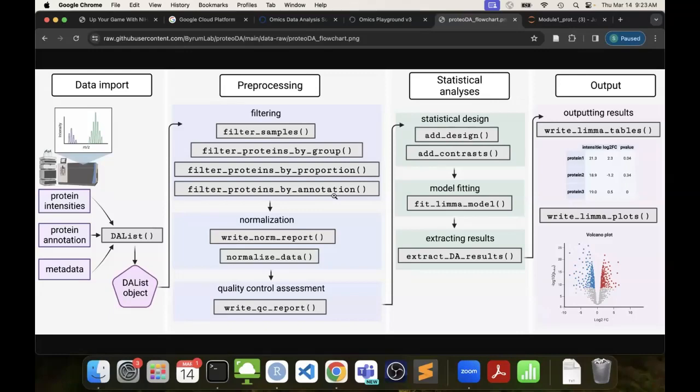That's why I like our interactive plots, to be able to interpret those. I'll show you what I mean by that in a minute. This is why you can't just hit a button and run the code. You have to make decisions throughout each of the different steps, and that's maybe why they still keep me around.